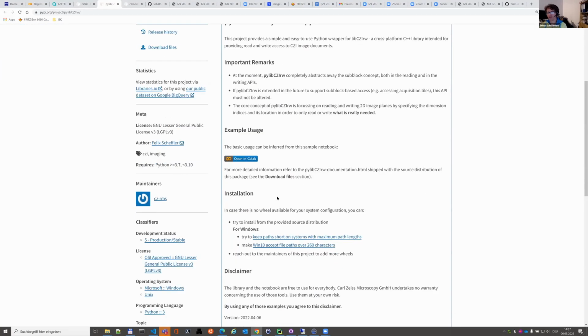Installing is straightforward. Pip install PyLibCZI read-write. As of today, we do not provide wheels for macOS, but that will probably change soon. We just didn't have time to do it. So people already pointed that out. I totally get it. So stay a bit patient.